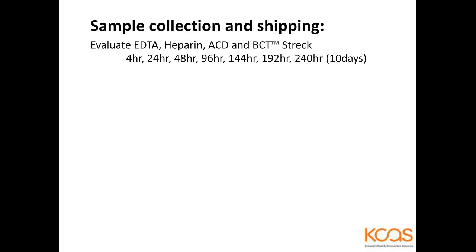So we set a baseline for flow cytometry of these biomarkers at 4 hours, and then we sampled these again at 24 hours, 48 hours, 96 hours, 144 hours, 192 hours, and 240 hours.